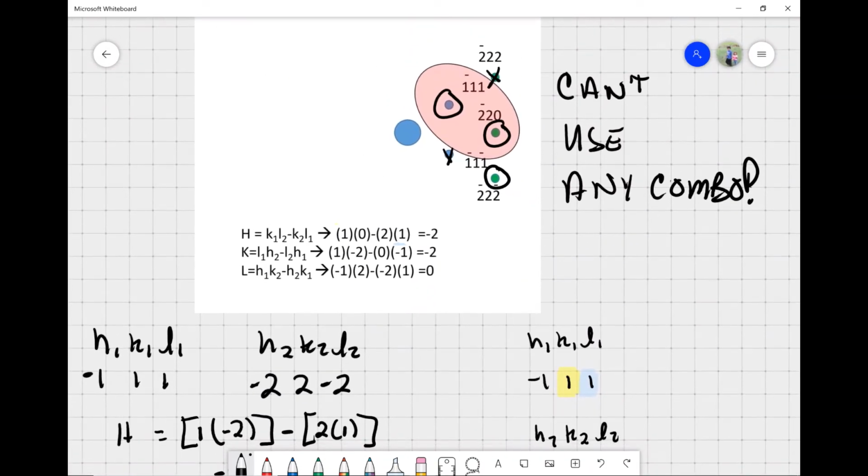If I pick this one, I can't pick the same order of diffraction, and I can't pick the very next one. So I can't pick the second order of the same spot, but I can pick the second order of the spot on the other quadrant, if you will. But I just can't pick the next adjacent one, and I can't pick the ones in the same order. So that's the ones you can't use. Hopefully this is helpful and clears things up, and I'll fix my previous slide.